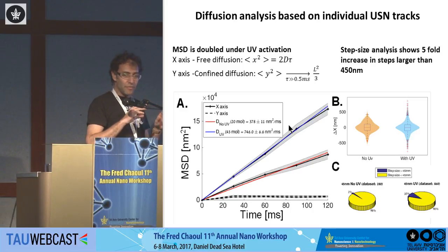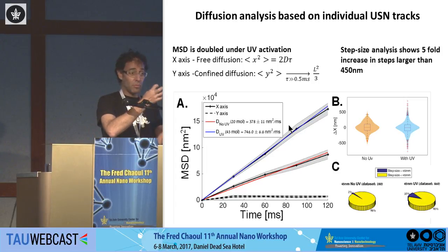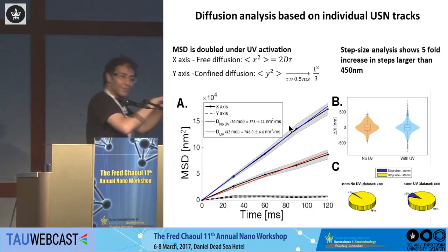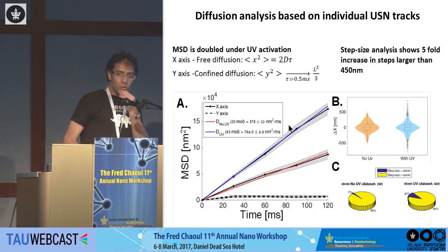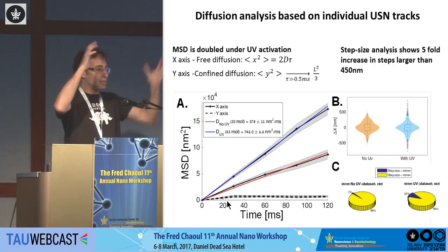This is very not trivial, because you can imagine that the size of these machines is on the same order of magnitude as the size of the water molecules and buffer molecules in which it sits. Just imagine yourself trying to swim in a swimming pool full of basketballs that are bouncing around and hitting you at 100 miles per second. It's not trivial that doing this in this basketball pool will propel you anywhere. But indeed, they go faster. And the advantage of doing this on the single molecule level, so this is a bulk result, okay? We are aggregating all our data and checking how far from the center these things can expand in a unit of time.